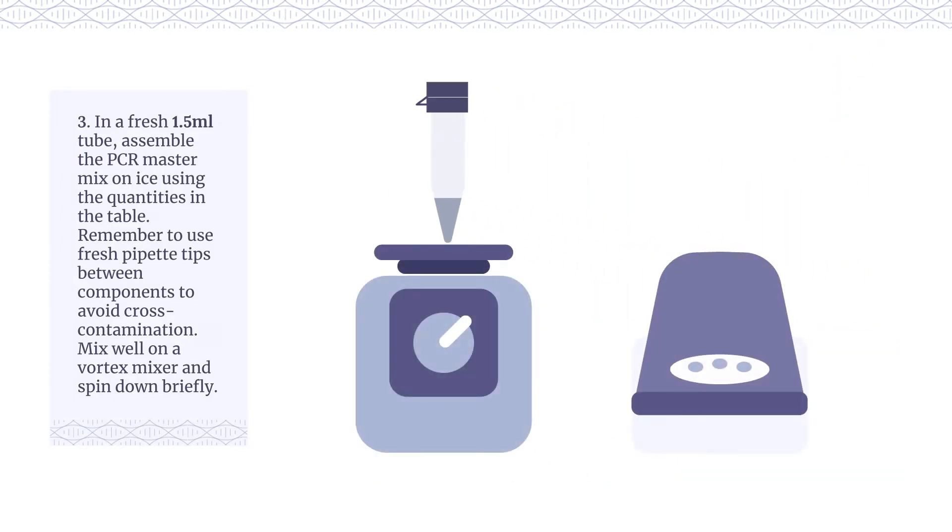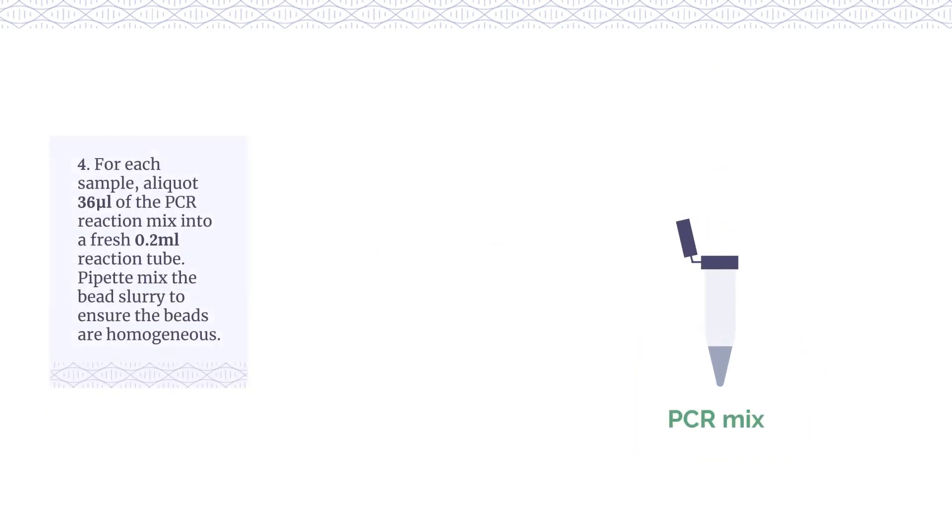Mix well on a vortex mixer and spin down briefly. For each sample, aliquot 36μL of the PCR reaction mix into a fresh 0.2ml reaction tube.